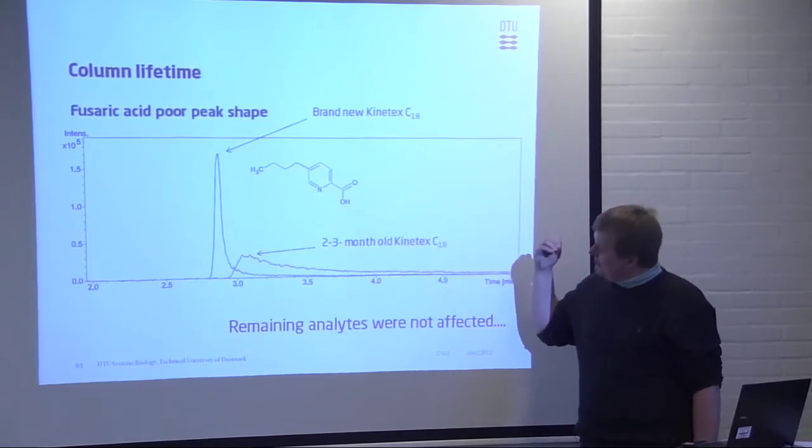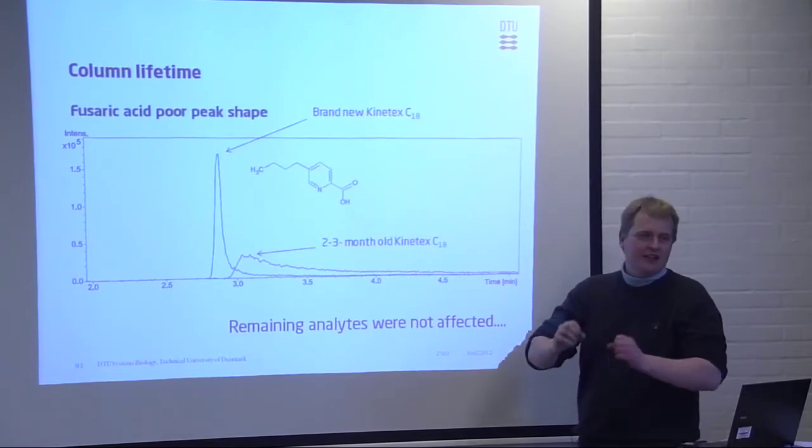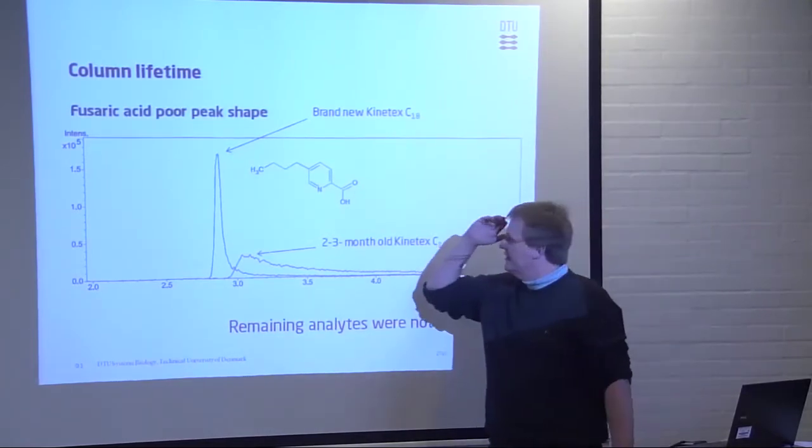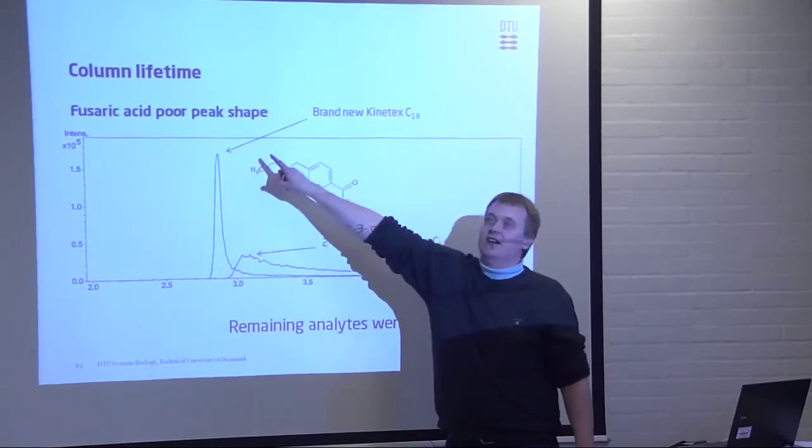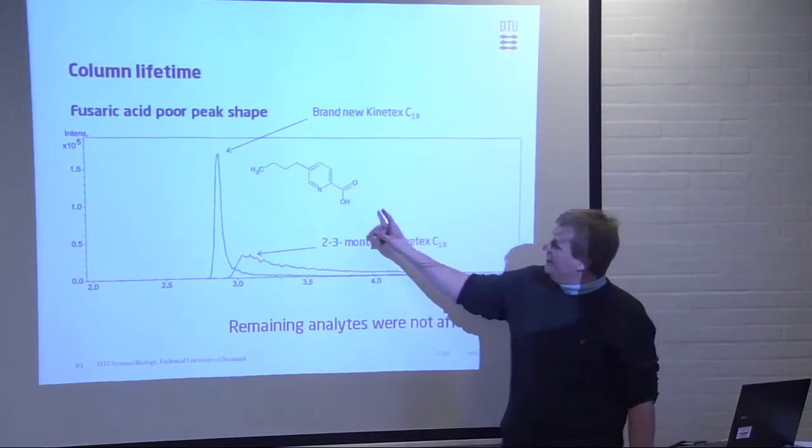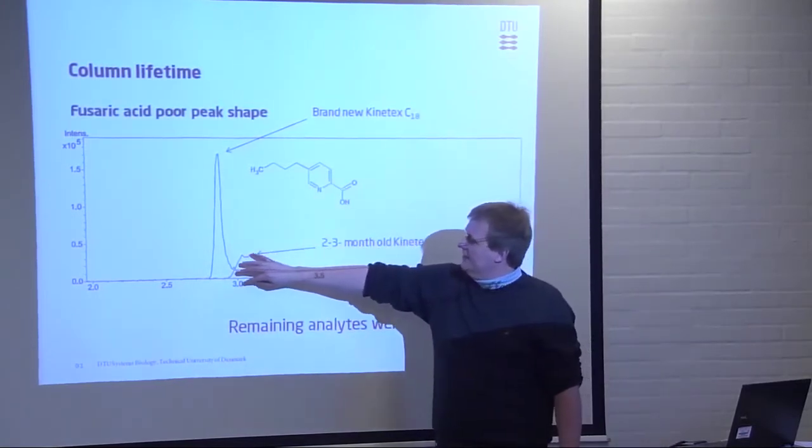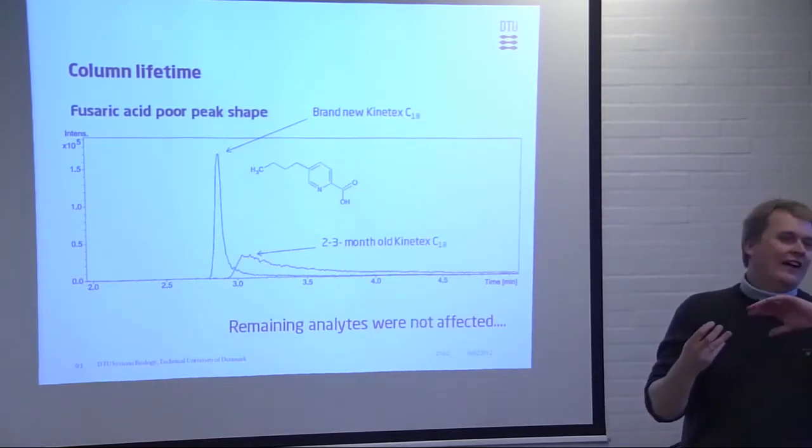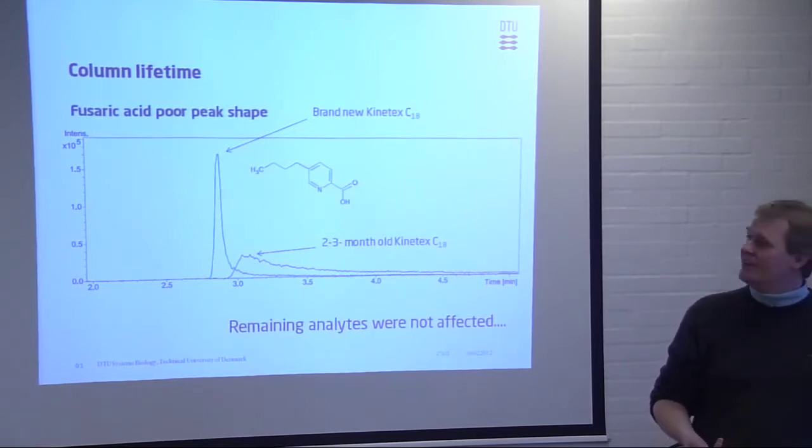We took the same brand of column. It was the same batch, everything, new one, into the system, two blank runs, and zipped this one through, and now we get a nice peak. So what happens here is probably some kind of ion exchange, and that there are some crap sitting inside the column, and our analyte is sticking to that. That's why we also have to change the column.